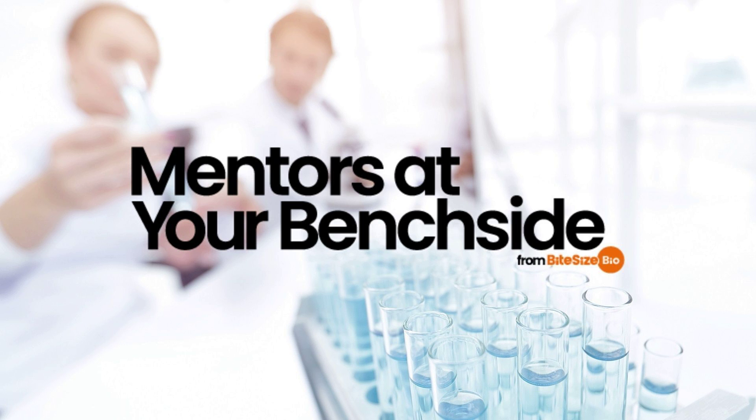I'm Eva Amson, and today I'll be talking to you about using OD600 measurements to find out if your bacterial culture is still growing. This episode is for anyone who has ever wondered, how do I know when my bacterial culture is done growing? When should I harvest my cells? We'll talk you through the bacterial growth curve and tell you how to check what stage your culture is in using OD600 measurements. Let's start by reviewing the 4 basic phases of a bacterial growth curve.